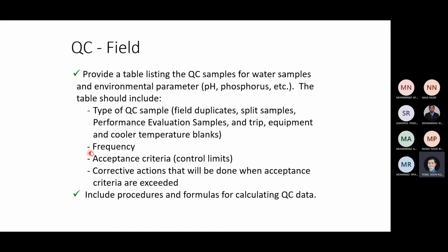Let's say after you measure all these QC samples, you discover that they are not within the acceptable region, that means something is wrong. Then you find out what's wrong, and apply countermeasures. We don't usually go back to the same site and sample another time, because that probably does not represent the earlier samples we collected.